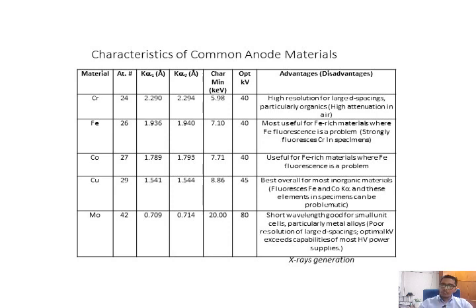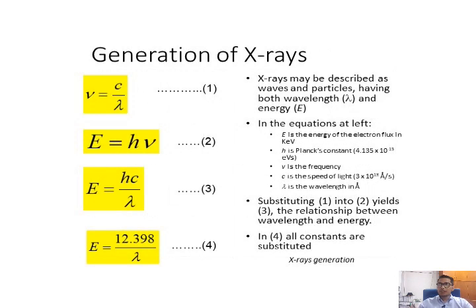So in generation of X-ray, it involves certain equations. If you see in slide number 12, the X-ray generation can be best described by having the waves and particles, in which the energy and wavelength are being considered in the equation.